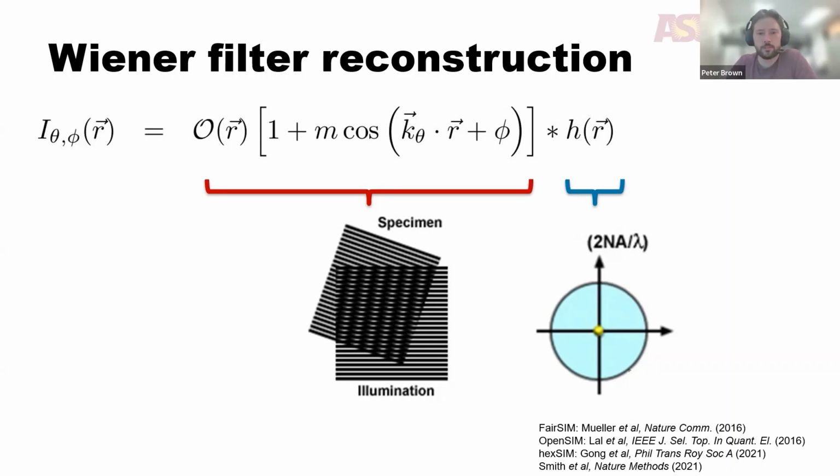So, the classic Wiener filter reconstruction. We begin with the forward model for image formation in SIM.